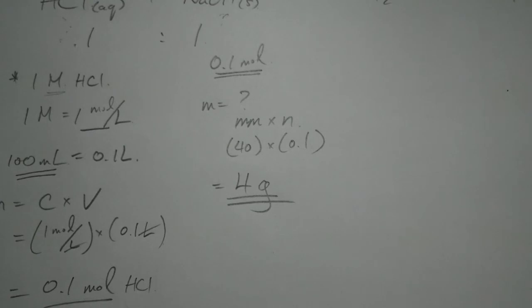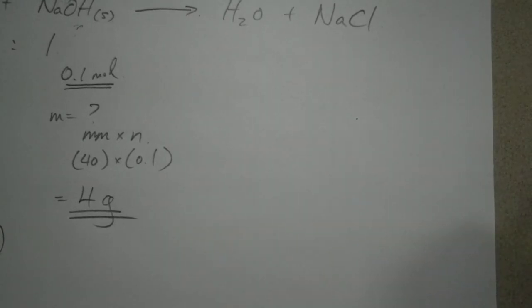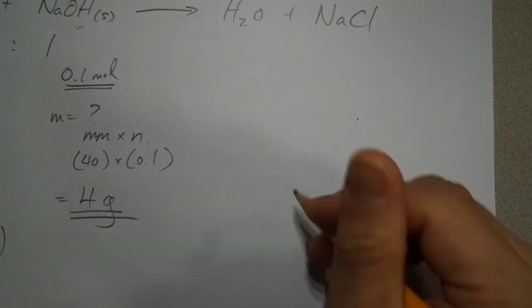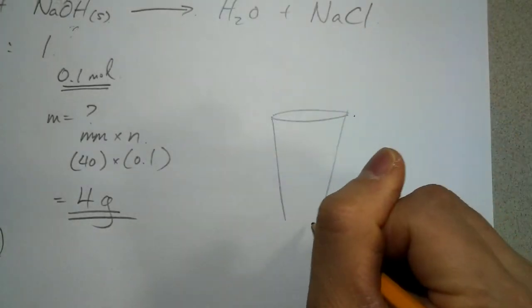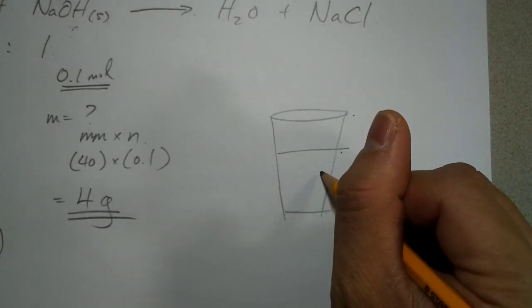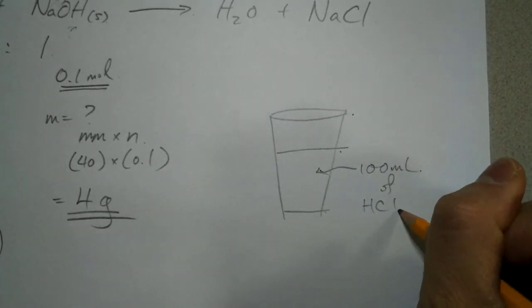Now, since I'm recording, I'm going to draw some diagrams here and talk about the safety while I'm on video, and then later I'm going to point out the little precise stuff over there. So can you guys all look up here, please? On the back of the room there are styrofoam cups, and what I'm going to ask you to do is to measure out, first of all, 100 ml of HCl.